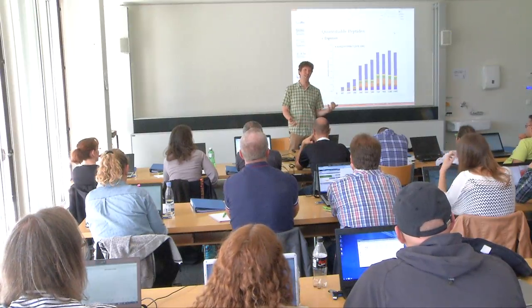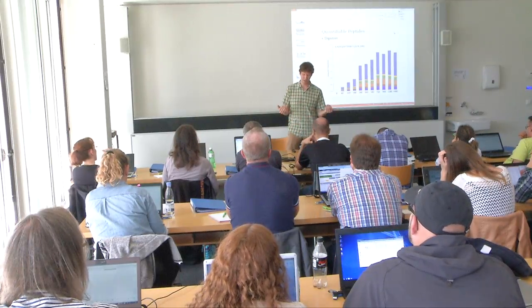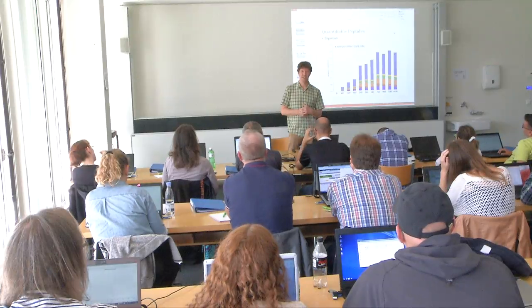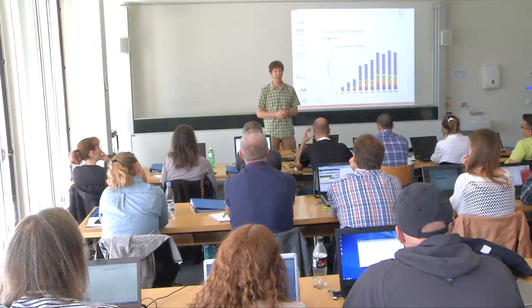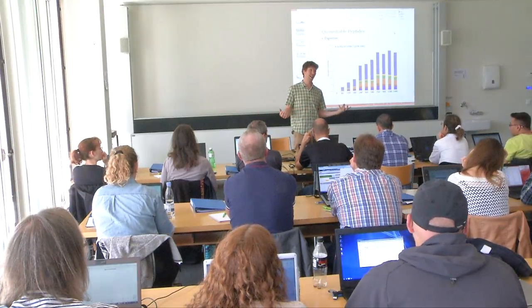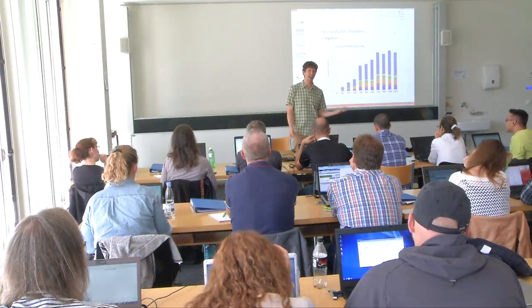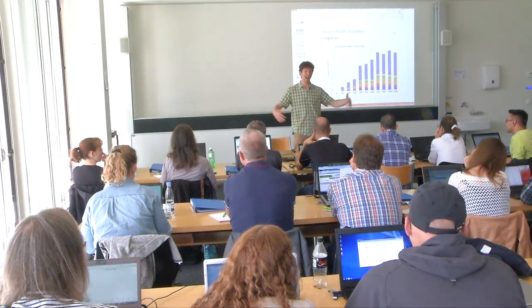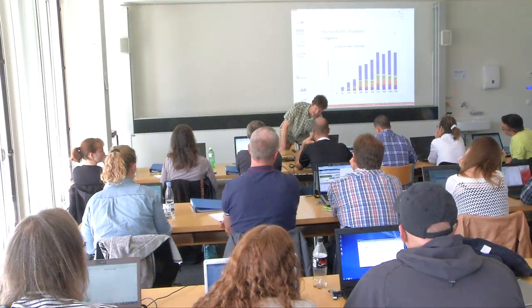Even with a tool that doesn't have an automated thing that pops things up, you can go through the samples very quickly. I've processed this entire data file as best I think I can in about an hour. So 42 replicates, 100 and something peptides. I think the rate of processing for somebody who's proficient in Skyline should be about 1,000 peptides in a day, with up to 100 samples. So I'm going to teach you techniques to do that.